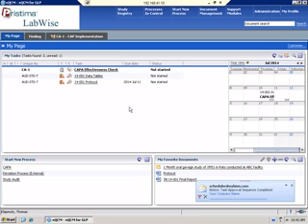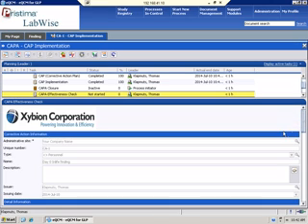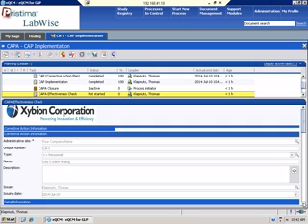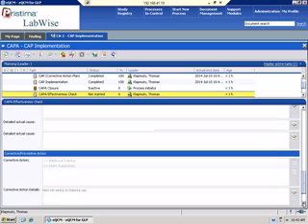Once I approve it, that was done, and now we're on to the effectiveness check. So you can have effectiveness, training's been completed, the person's working on their supervision, and we go back through the process. Again, you can have a CAPA that could be 1 step, could be 5 steps, 20 steps. If there was no further action, this one could have closed out automatically, but we're working through the form.